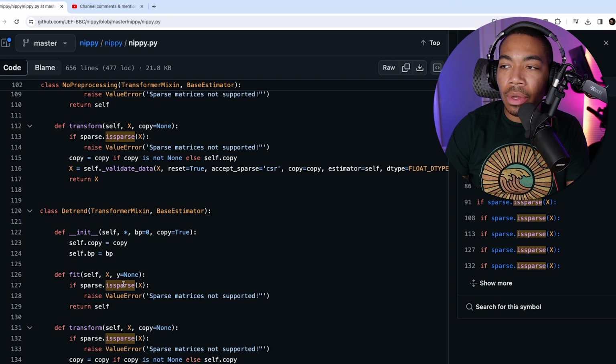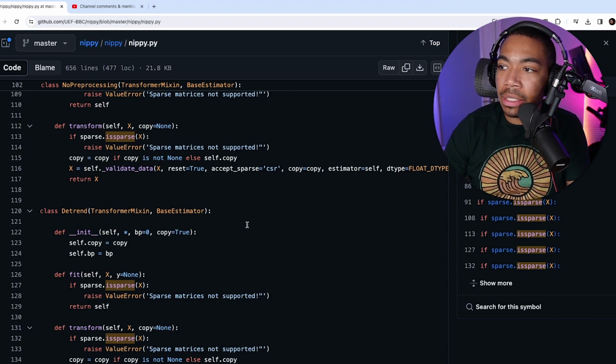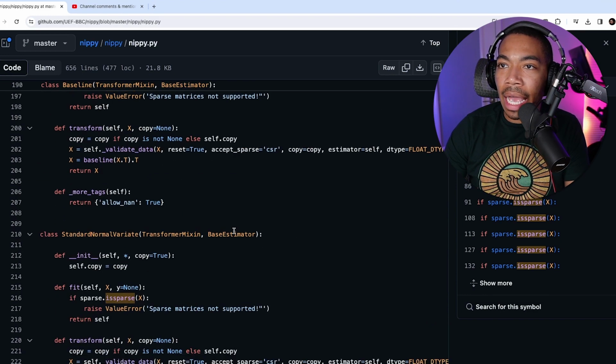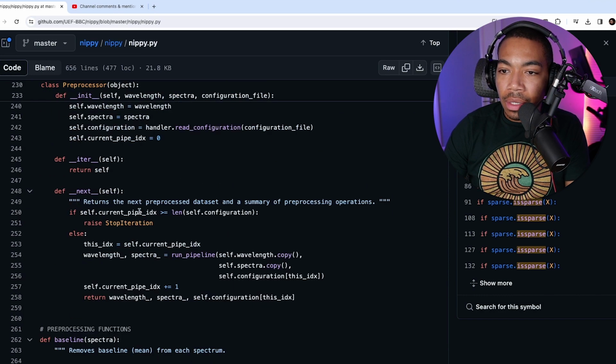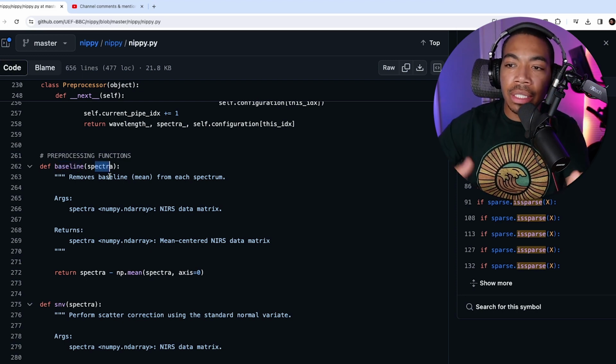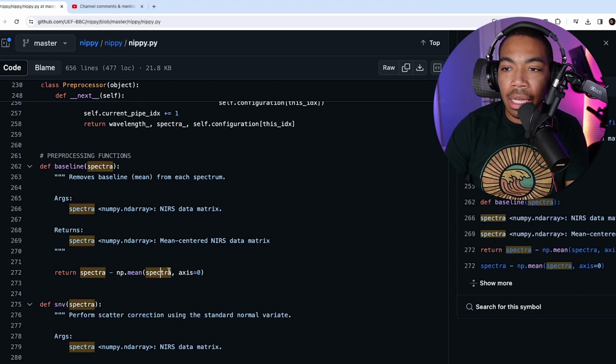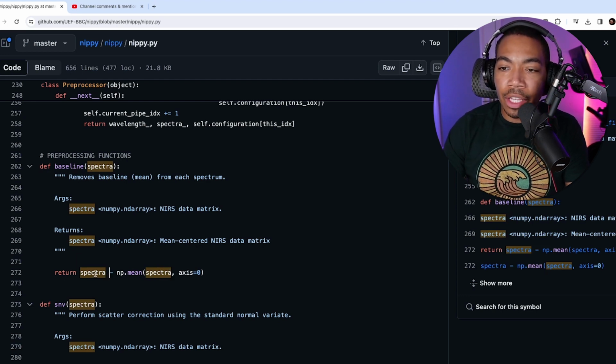A detrending. So lots of things that we have explored and some new techniques. So I definitely look forward to making a full video looking at this. Now let's go down further to see what else they have in here. Okay, so here they do call out some specific preprocessing functions. So they have a baseline function where they take in the spectra. And so again, we do need to look at what the shape is, but the baseline corrector is just subtracting the mean of the spectrum from each spectra. So we've done this before.